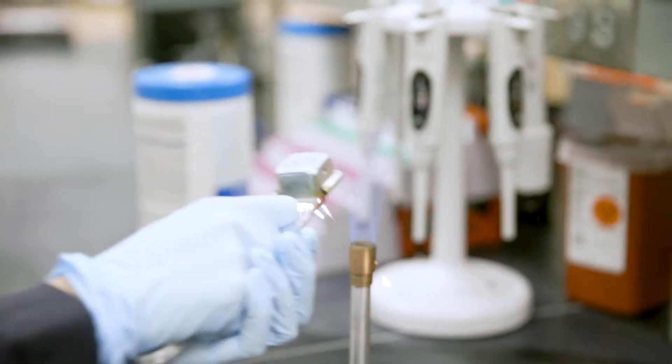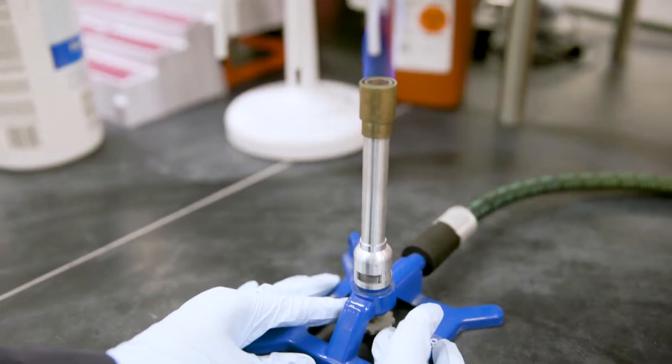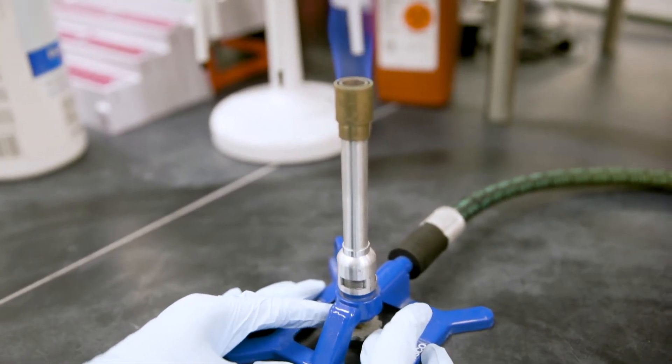Once you ignite your flame, you can adjust the gas flow using the gas valve at the bottom of the Bunsen burner.